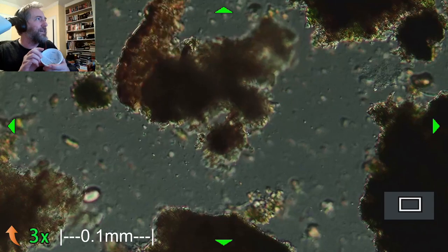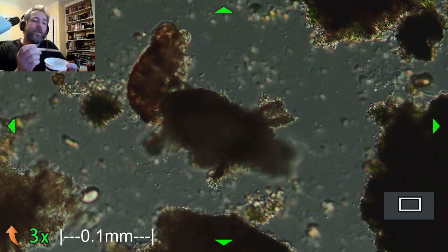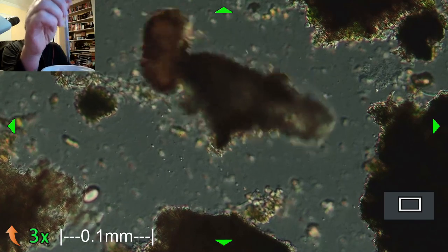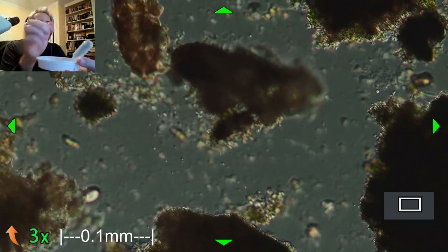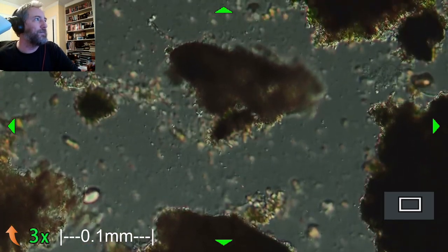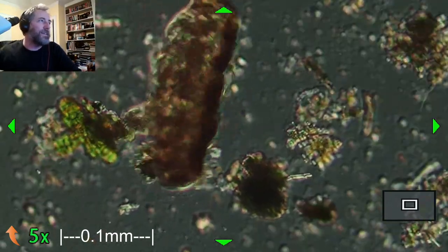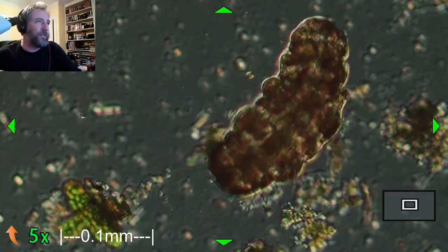And then I scraped it with a knife into this little container. You can kind of see into there, I think. And then I have just a little pipette. I let it settle just a little bit, so maybe I can get close enough that you can see there's a dark bit of junk. I just dropped that onto a piece of microscope glass. I didn't even put a cover slip on it because I didn't want to squish anything, but it limits how close we can get to the water bear. That's okay because I can always zoom in with my optical zoom on my camera. If we needed to get a little closer, we can just click in a notch, because I just have a 10x objective on here.